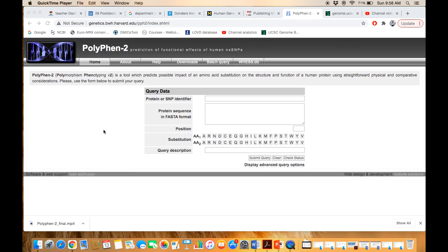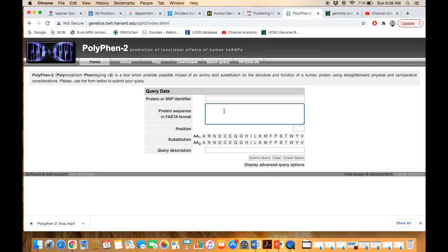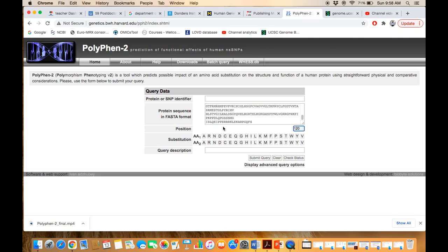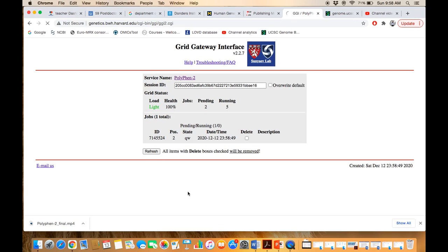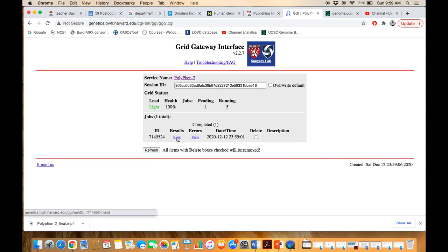Now, using the same GUCY2D protein, let's look at another example with a different amino acid substitution to check whether a change could be pathogenic or not. Following the same procedure, I paste the sequence and specify position 120. The wild type arginine at position 120 is replaced with aspartic acid. After refreshing the page, the result is generated as a hyperlink — click on it.